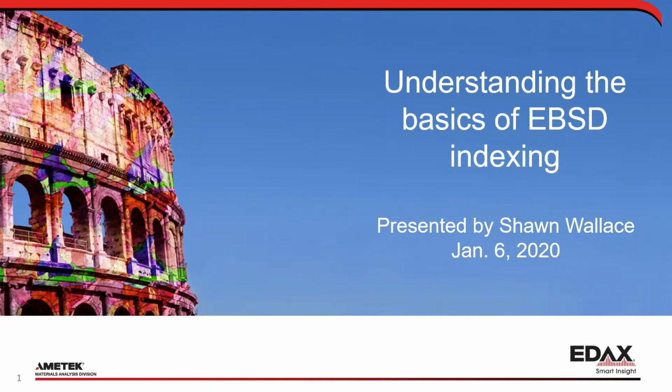I don't want to get too far ahead of myself, so I'm going to start with the presentation a little bit early, but I think we have enough people here. Understanding the basics of EBSD indexing. Oops, give me a second here. Here we go. So here's the general outline of this talk for pattern indexing.